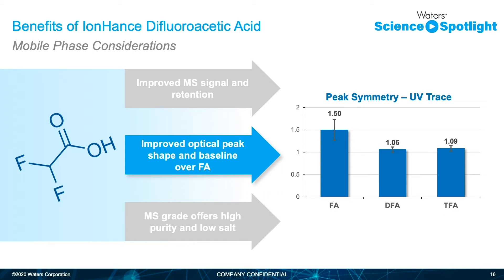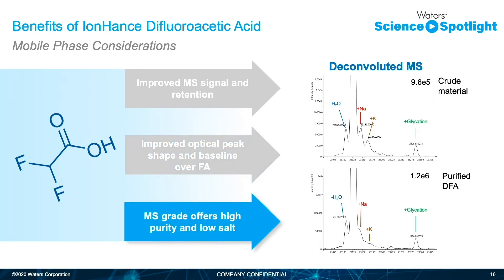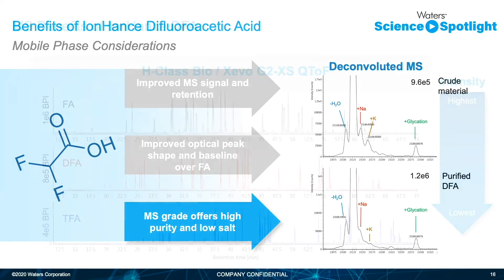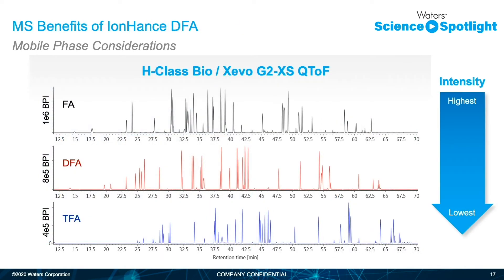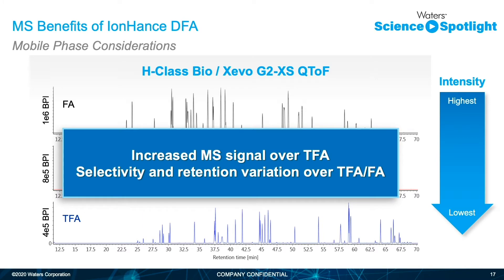But for optics, DFA — difluoroacetic acid — has a much better peak shape and baseline than formic acid. The high purity of I-enhanced DFA removes impurities and extraneous peaks from your chromatography. In this example of high resolution MS, the improvements of retention over formic acid and increased peak area over trifluoroacetic acid are clear simply by switching to difluoroacetic acid. It may not offer the same level of intensity as formic acid for MS applications, but the change in selectivity can be key for troublesome separations.